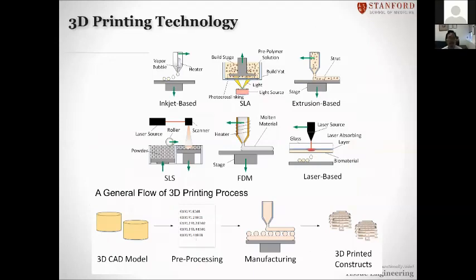So here, some 3D technology, like inkjet and stereolithography, and also extrusion-based and FDM. So you are familiar with this 3D printing technology. All of this 3D printing technology has been used for bioprinting. So right now for bioprinting, we are characterizing two types.